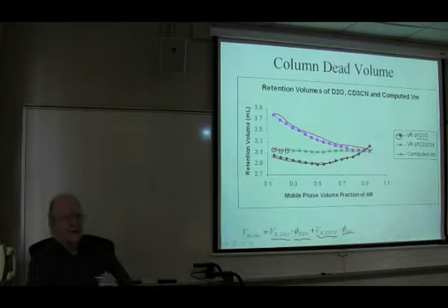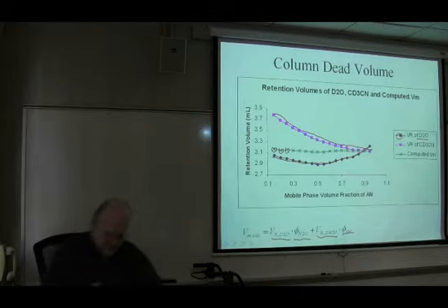Don't waste your time doing this if you're just looking for a quick and dirty understanding of what's going on. You can use thiourea, you can use uracil, but you're not going to get beautiful results. You'll get useful results, but they'll be complicated by the fact that uracil's retention does vary with mobile phase composition. If you want a rough and ready estimate of a retention factor, use uracil.